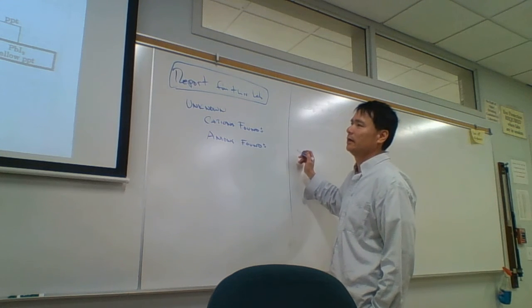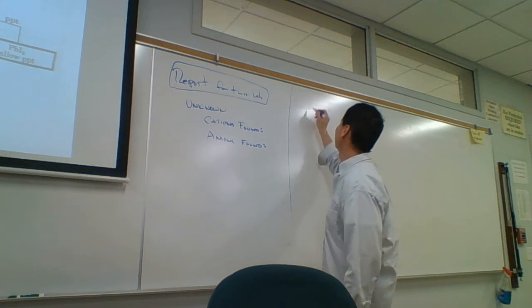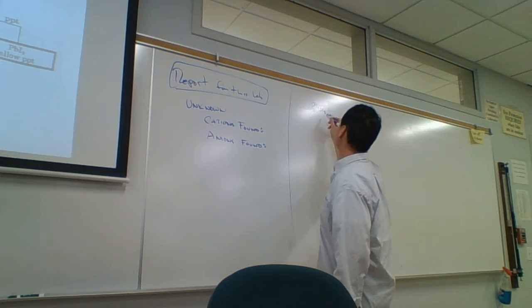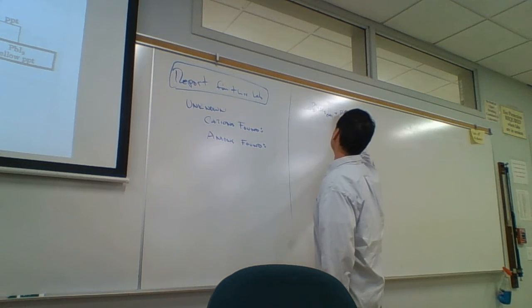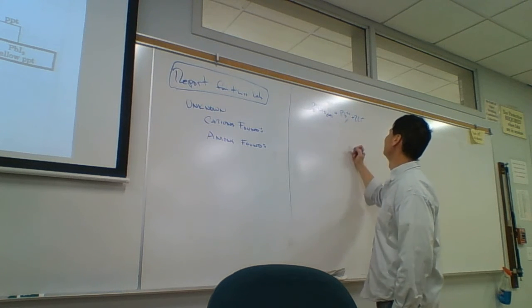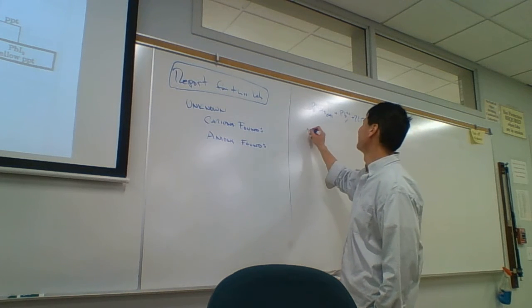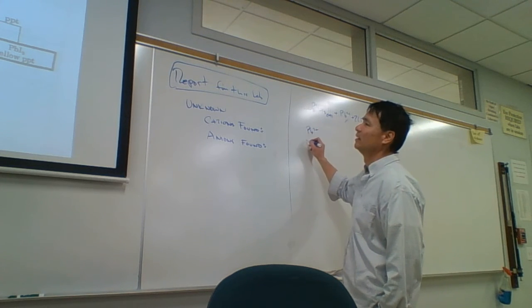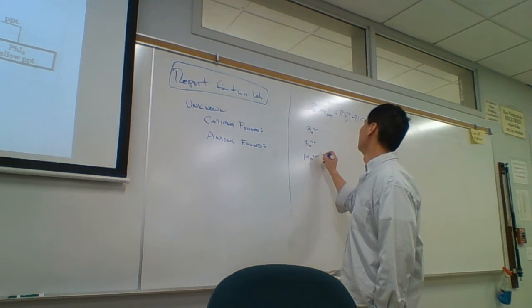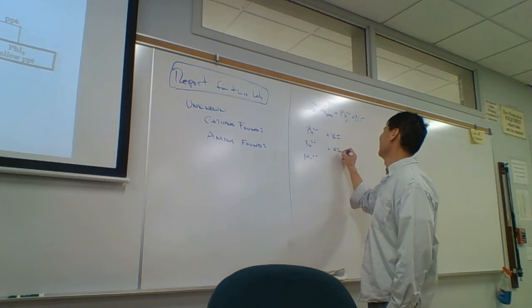Okay, the next thing we're going to do is go down the right branch there at the top. So when we go down the right branch, we know that PbCl2 aqueous is actually Pb2 plus plus 2Cl minus. And so what we're going to do in the next step is take Pb2 plus, Ba2 plus, and Mn2 plus, and then add KI to this.